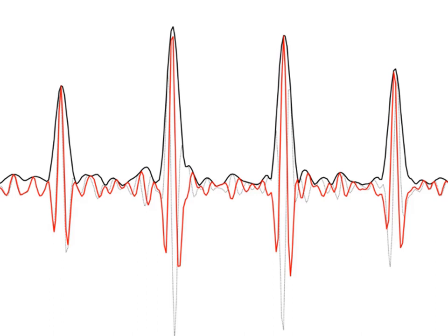Secondly, if you have a well phase corrected spectrum and a small number of peaks within it are not well phase corrected, then you'll be able to see this because their side lobes will be unusually poorly symmetrical compared to the other peaks in the spectrum. This tells you something important about those ions. For some reason they haven't ended up with the right phase angle for the frequency they were detected at.